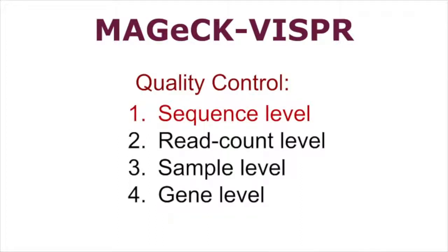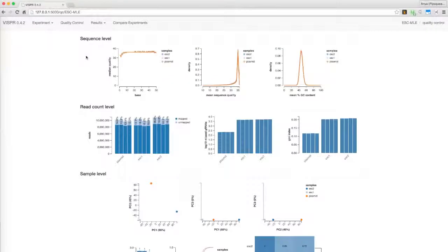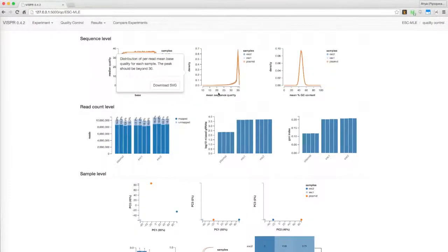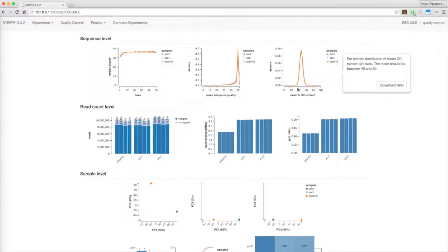Sequence level quality control measurements aim to display possible sequencing errors based on the data in FASTQ files. These two graphs show the base quality distribution of sequencing reads, while this one displays GC content distribution.